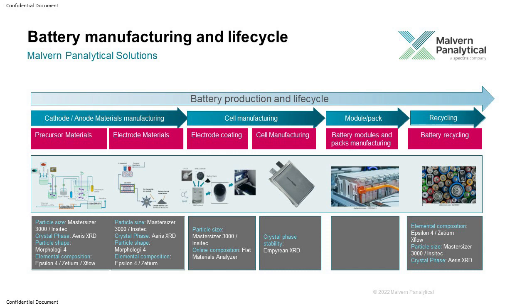When you make the battery cell, this powder material is turned into a slurry, which is coated onto the current collectors. So here again, for the slurry rheology, you have the rheometer here, with which you can measure the rheological properties of the slurry. But these rheological properties are very interlinked to the particle size and shape. So if you want to change the rheology, the only way is to change the particle size and shape. And of course, you can also change the formulation. And then you have the battery cell.